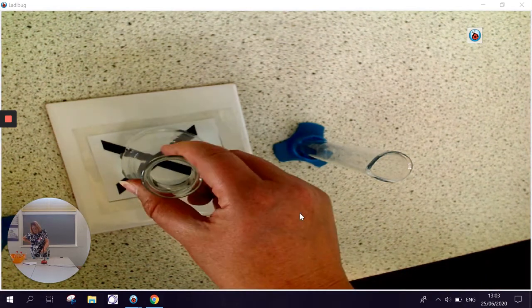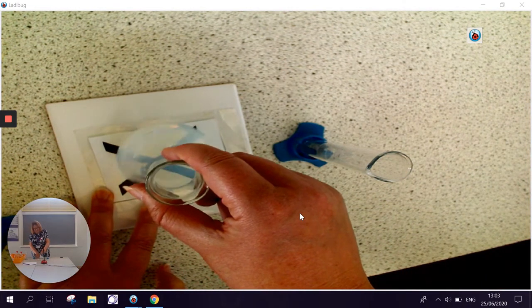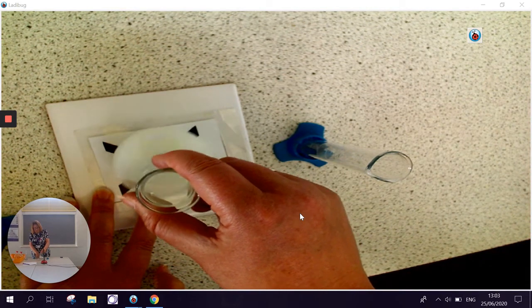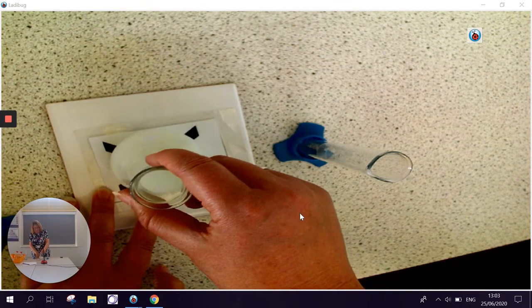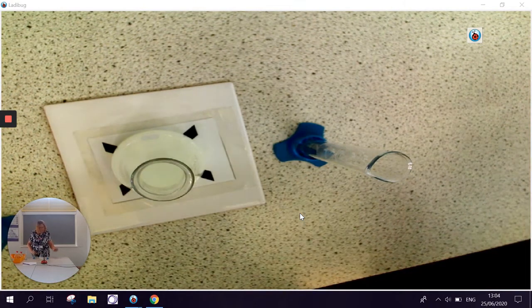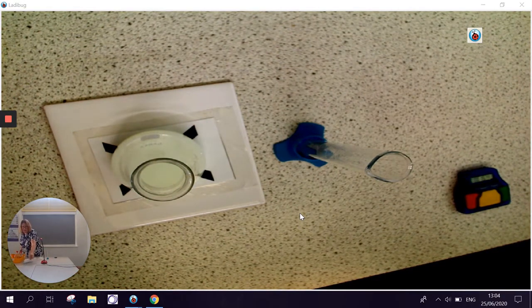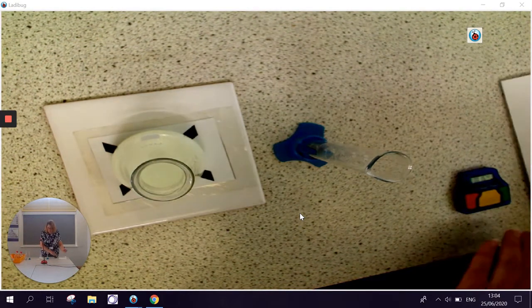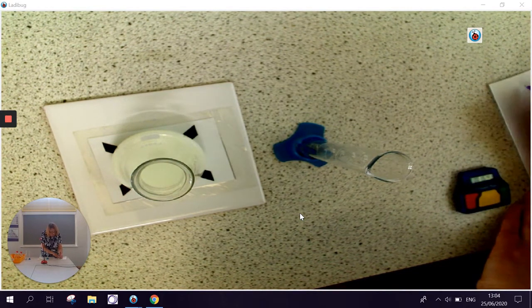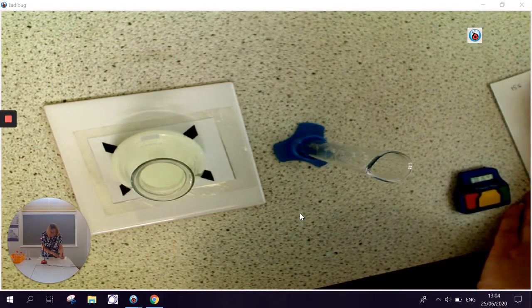You can swirl it gently, but you need to make sure you do that steadily with each one of your solutions. That one took 15 seconds for the solution to become opaque. That's the sulfur being formed — it's a solid and it's not soluble, so it's come out of solution. I'm going to write 15 seconds down, and that was our 0.5 molar.